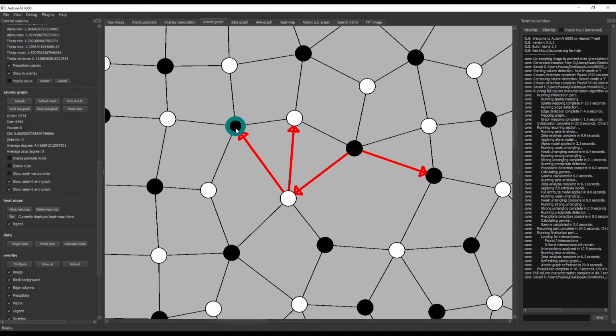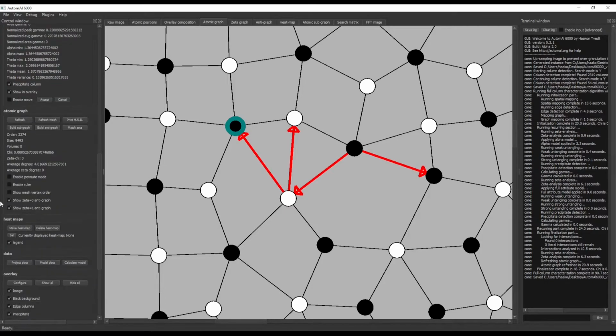This means we have to manually change the species, and as you know, you can do this from this menu here, but that is slow, so I would use the numerical button 4, and 4 was magnesium. Again, an overview of all the buttons can be found on the web page. If I press 4, this line suddenly becomes black, because now that the software thinks that this is magnesium, this one gets an extra arc to extend, and this arc becomes symmetric.